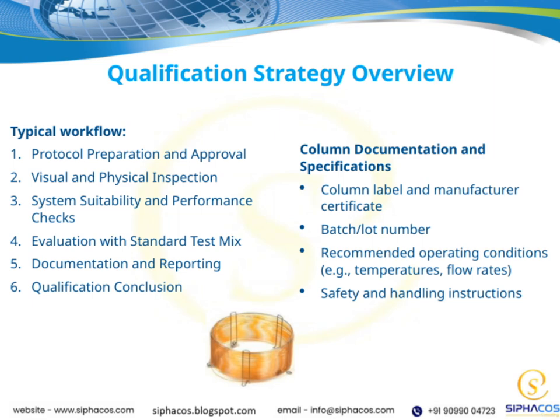Then, visual and physical inspections are performed to verify the condition and integrity of the equipment or materials. Following that, system suitability and performance checks are conducted to confirm everything functions as expected before proceeding. We also evaluate the system using a standard test mix, which helps ensure accuracy and reliability in real-world conditions.